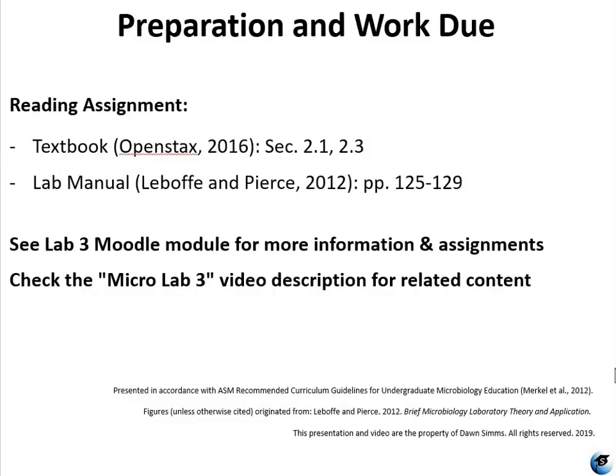So I hope you really have fun with Lab 3. We're going to be looking at things that are on a larger scale as much as possible. When we get to some of the smaller things in Labs 4 and 5, you're going to see even more online simulations and stuff. But for Lab 3, you should be able to see all of these specimens. You should be able to focus them and have fun with it.